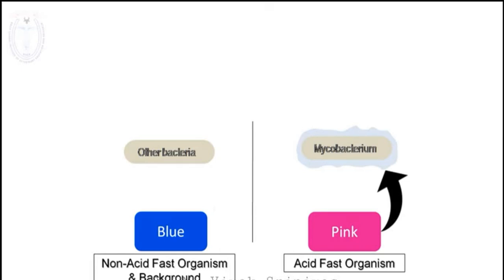In this experiment, the three important solutions required for conducting the acid-fast staining technique are present. Apart from this, the other requirements are the forceps, the blotting paper, and the microscopic examination.